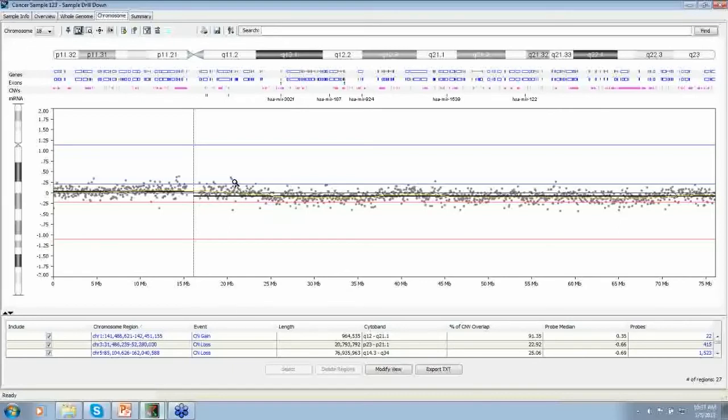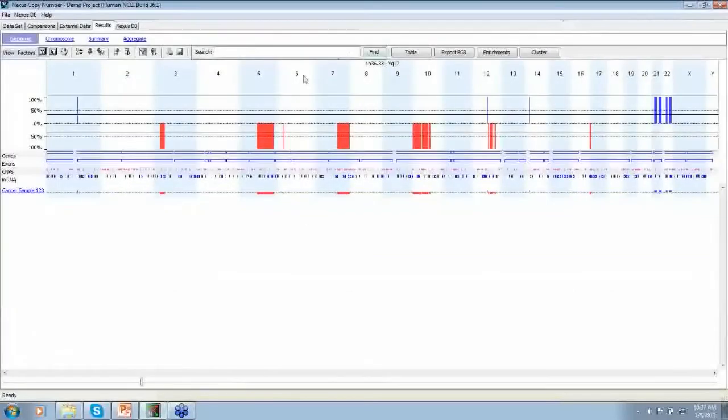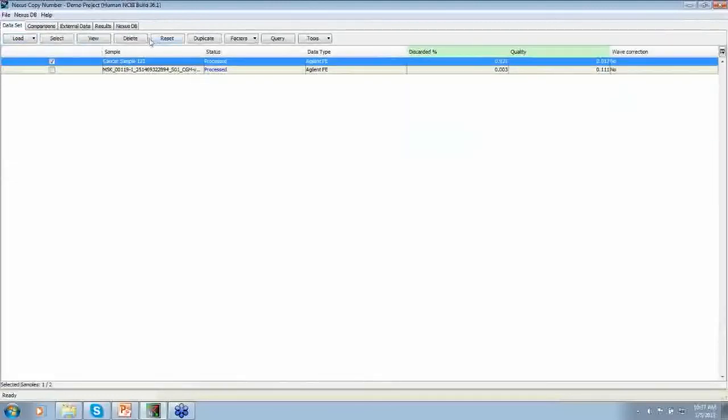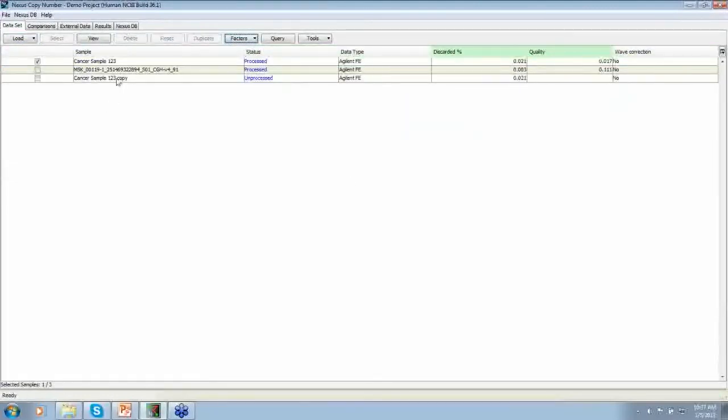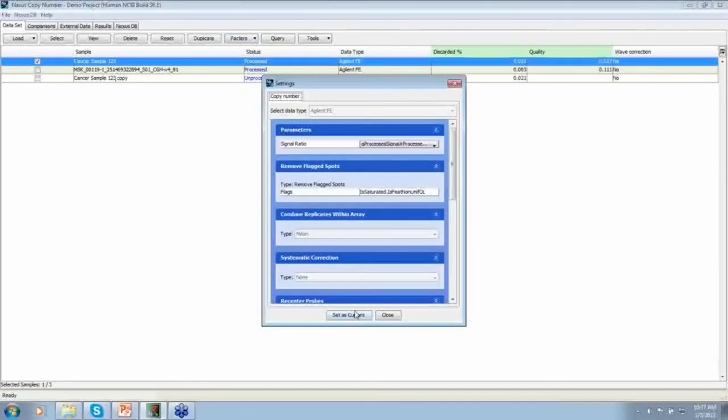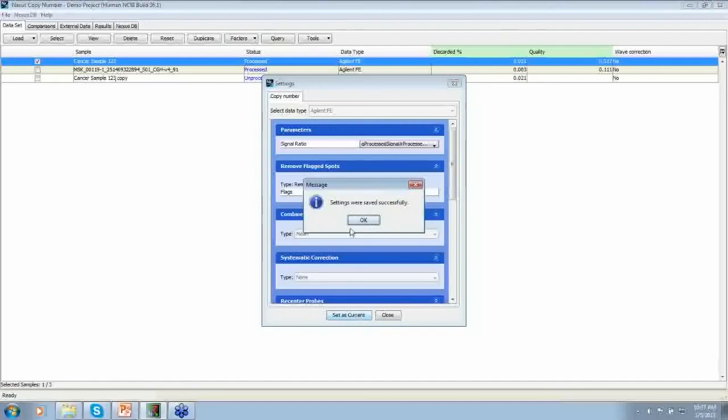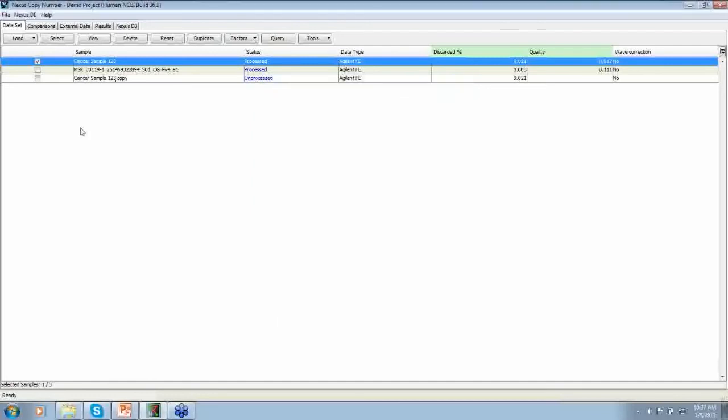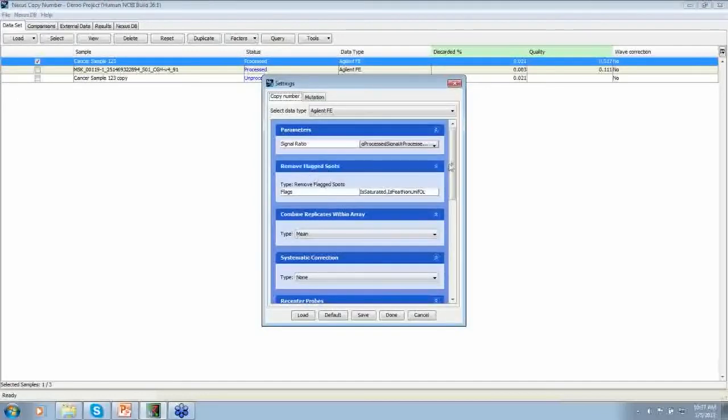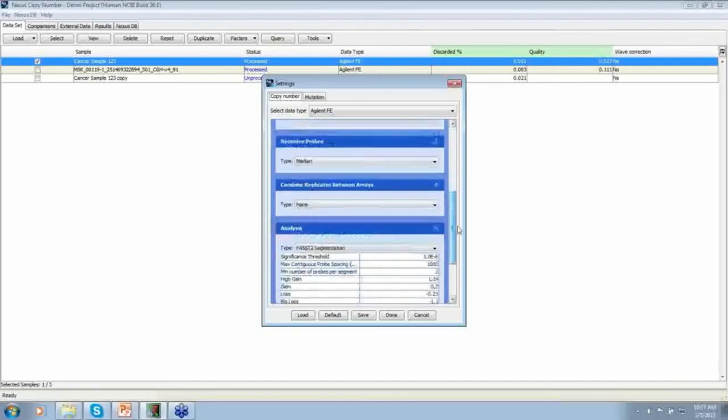So depending on how low of a mosaic level you want to call, you can make adjustments. So in this case, let me duplicate this sample and we are going to process this sample by changing the settings.